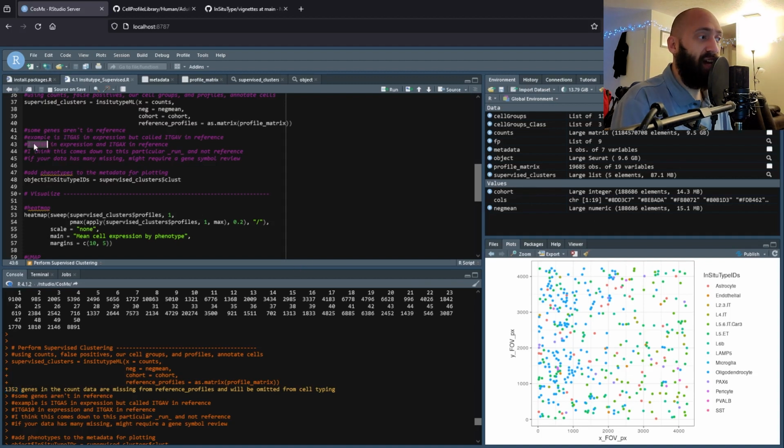Another one is ITGA10, the integrin alpha 10. In the reference data, and I think this is the more correct one, it's ITGAX, so Roman numeral 10. If this is something that comes up in your data, I would talk to NanoString or whoever the vendor is that provides the data, if you're using Xenium like 10x. But that's something to keep in mind too. You might have really low, I shouldn't say low, depending on how many genes you have in total. So here maybe, I don't know, 20% of them didn't intersect, but we have a high number that did. Just something to keep in mind.